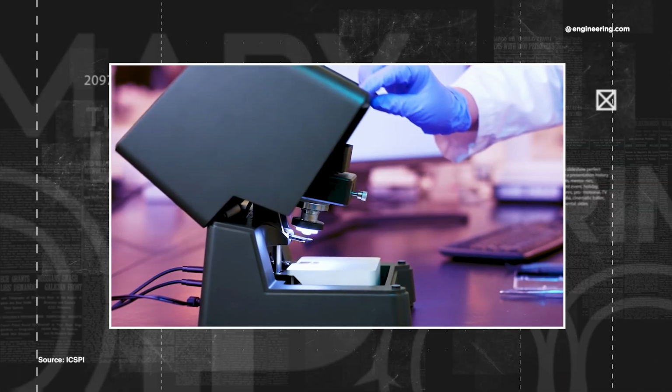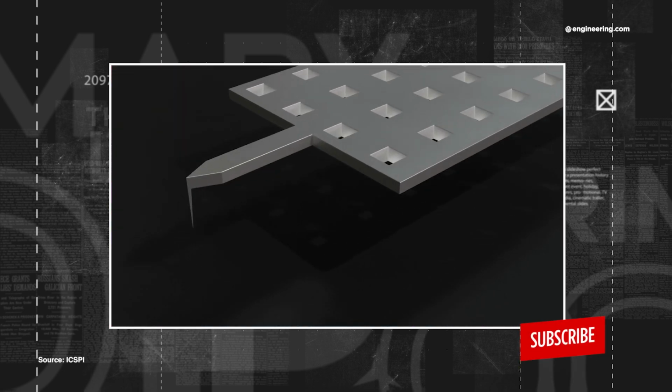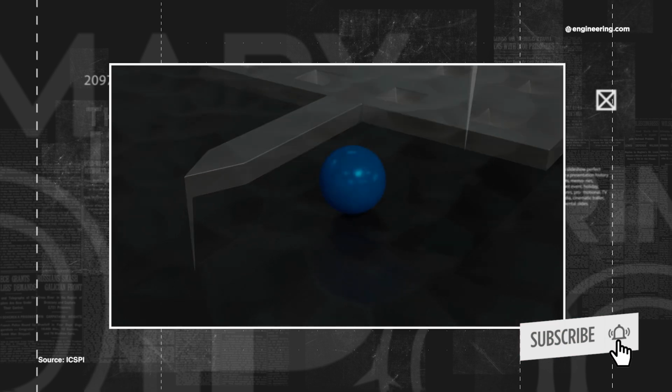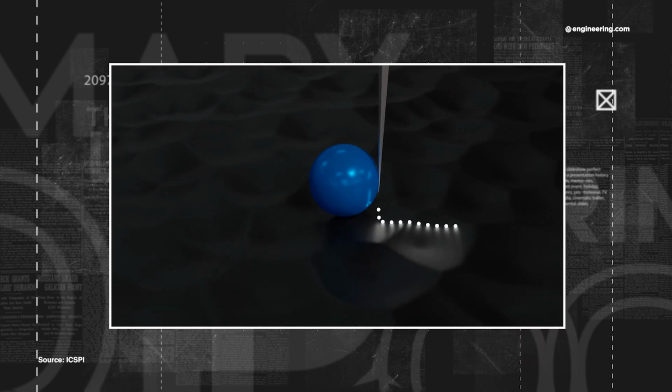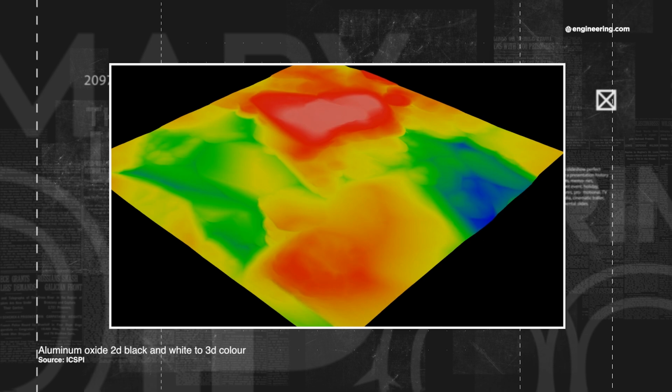Dave, to start, can you define, please, what is atomic force microscopy? Sure. Atomic force microscopy, or AFM, is a type of microscope that doesn't use any lenses. Unlike optical microscopy or SEM, it's a physical type of microscope that works a lot like a record player. We have a sharp stylus that moves over the surface of the sample, and it collects the 3D topography data of that surface. It gets so close that we're detecting the intermolecular forces between the sample and the probe, and it does that at extremely high resolution.